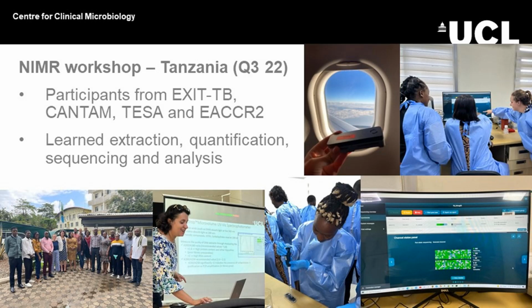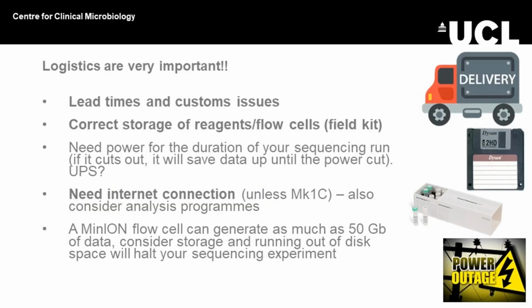It did actually make it somewhere. We went to Tanzania and we ran a workshop, me and Sylvia, who is not here. We had about 20 people from all over East and South Africa from different sites, and they learned the whole of the sequencing pipeline, and everything was fine until we started to set up the sequencing run, and we didn't have good enough internet, and so there were people running around looking for Wi-Fi hotspots all over the lab, and it was chaos. And it took me 6 times to get it to start, and then it was fine. But a man had to stand there with his Wi-Fi hotspot for about 20 minutes to get it to work.